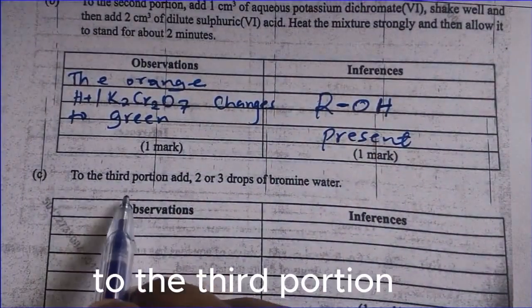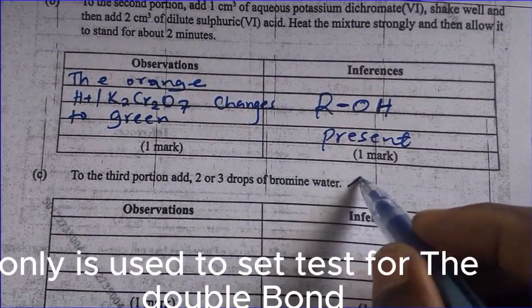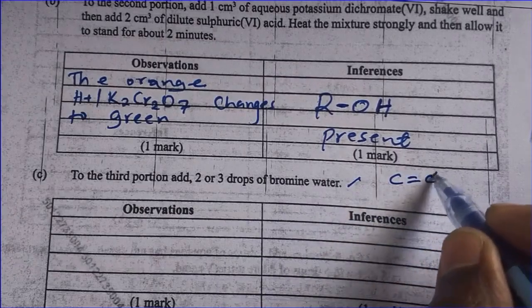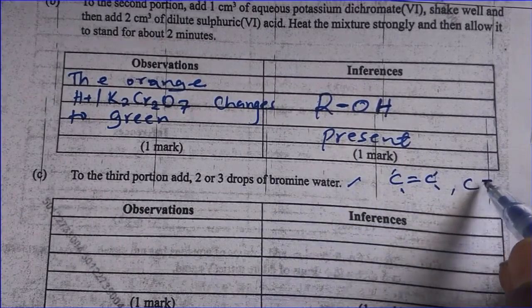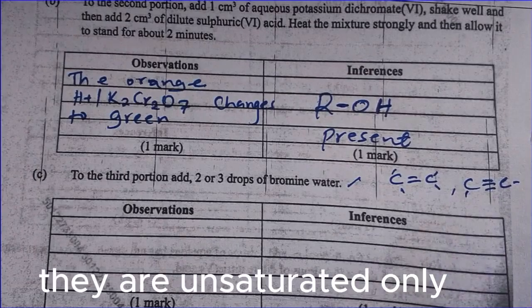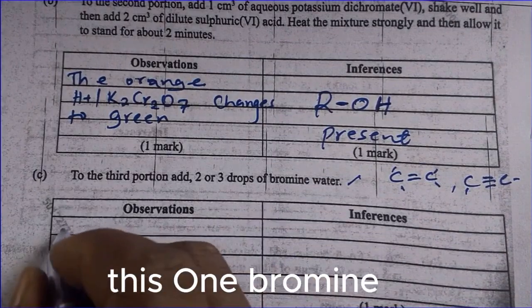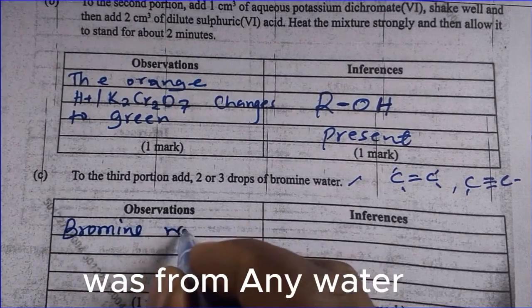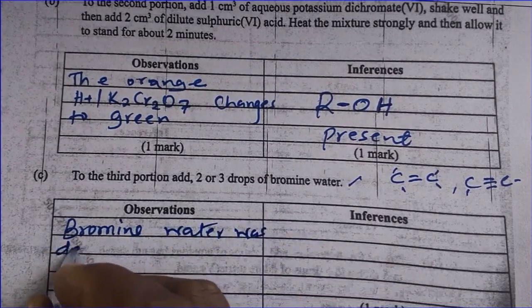To the third portion, add 2 to 3 drops of bromine water. Bromine water is only used to test for the double bond and the triple bond, saturated and unsaturated, the unsaturated only. So if the color changes to colorless, for example, the bromine water was decolorized.